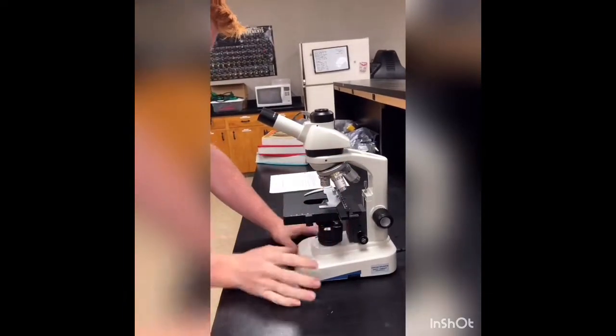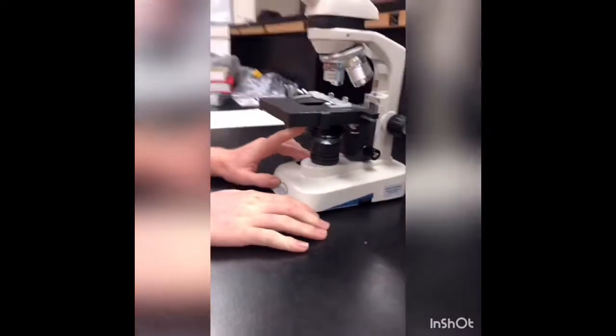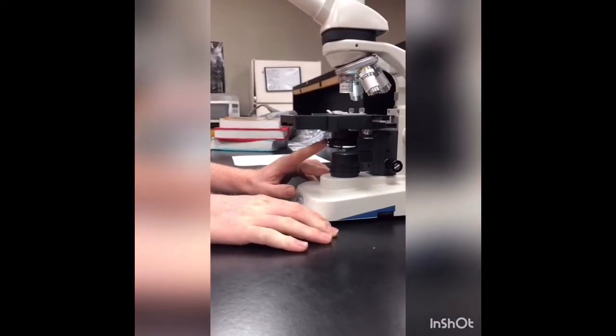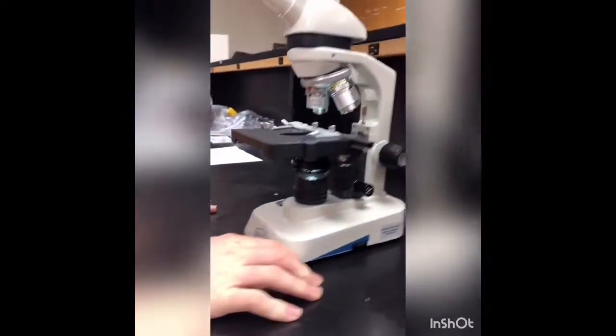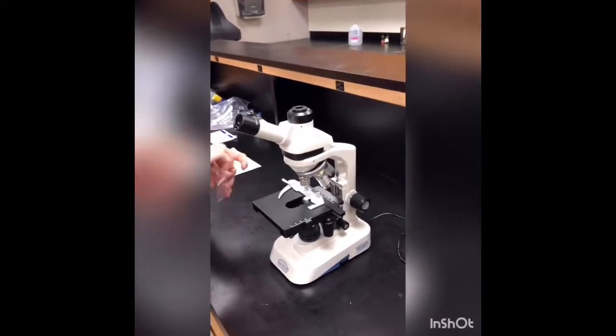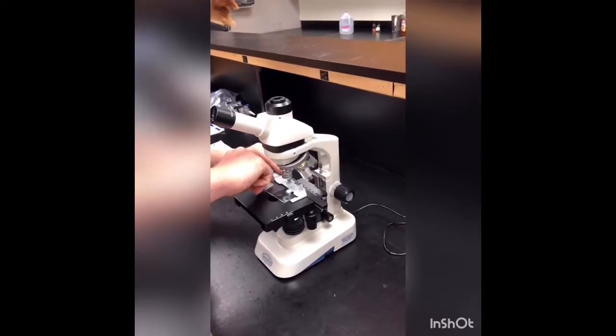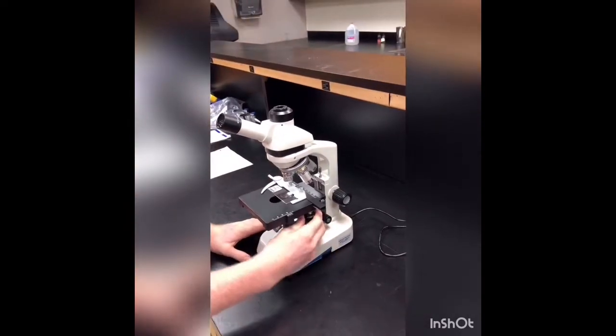And then you want to turn your light on and move your diaphragm, which is this down here, all the way so that the light is coming completely through so you can see your specimen clearly. And then you want to grab your slide with your specimen on it. You want to place it right here and put this arm down so that it holds it very nicely.